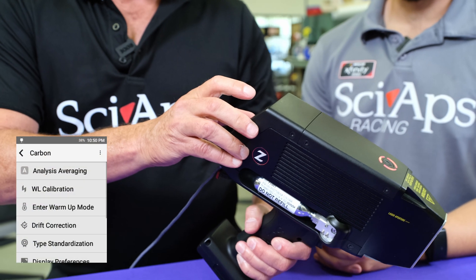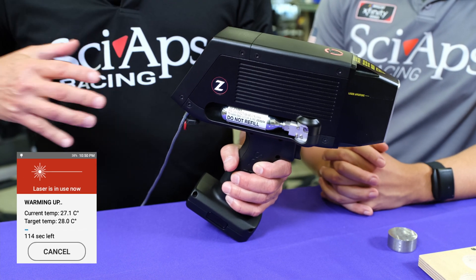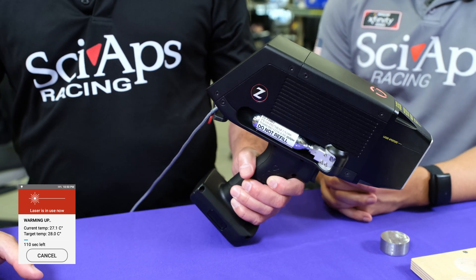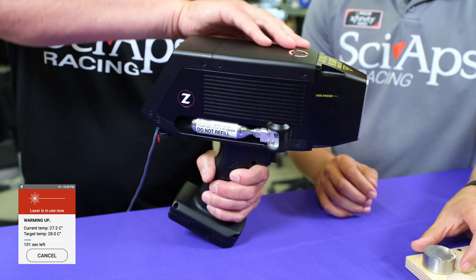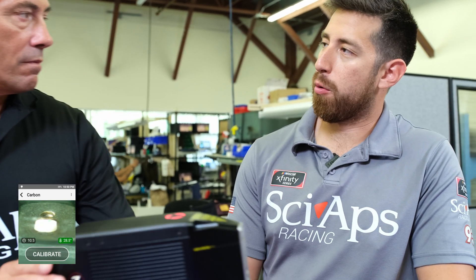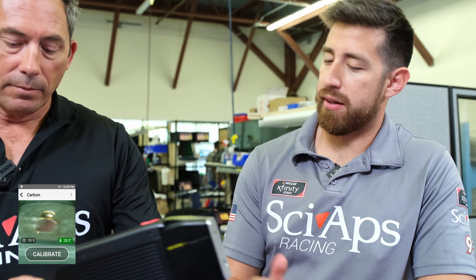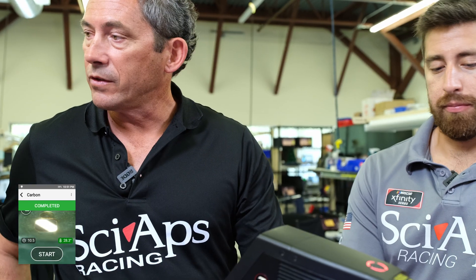Another feature: we put it in an automated warm-up mode. All these optical technologies like to run in a controlled temperature regime. When you turn the unit on from a cold start, it actually fires the laser internally — nothing coming out — to warm up the electronics and get the unit up to 28°C. The unit likes to run between 28 and 40°C, and it's really hard to get it above about 35°C. I love the automated warm-up because I can press start, go do my reporting while it warms up, and not worry about it. Once it's warmed up, you hit calibrate — it shoots an internal piece of stainless steel to set the wavelength scale — and then you're ready to test.